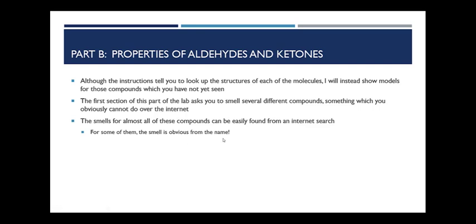For example, cinnamaldehyde should give you a big hint as to how that compound smells. The only one of these that might prove to be a bit difficult for determining the smell is camphor. And the words that I've seen used on the internet to describe its smell are minty or medicinal. And medicinal can mean a lot of different things to people. When I see medicinal, I usually think it smells like rubbing alcohol. And camphor doesn't really smell anything like rubbing alcohol.